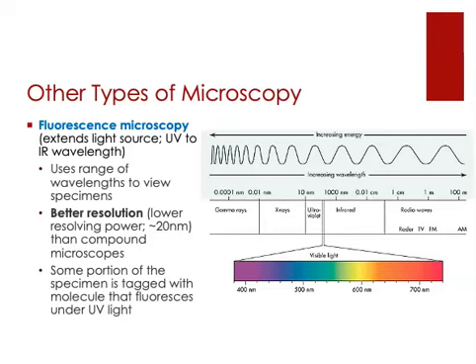They might bind to protein, or they might bind to DNA or some other type of molecule. But this time, they're also capable of fluorescing under an ultraviolet light. So not only are we going to see a color, we're going to see a very bright fluorescent color when we look underneath the microscope.